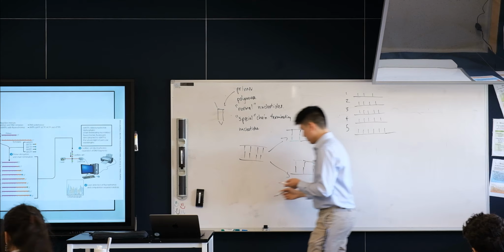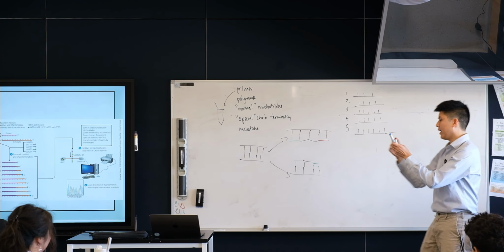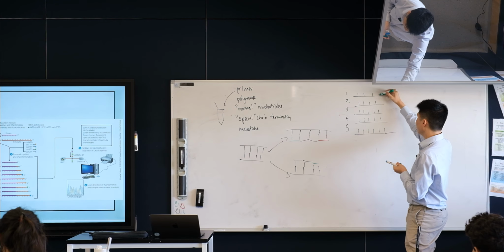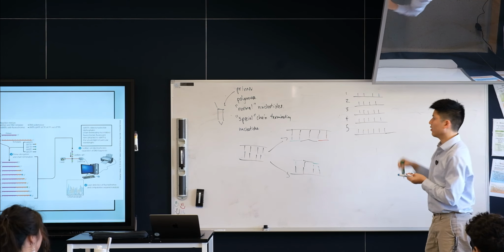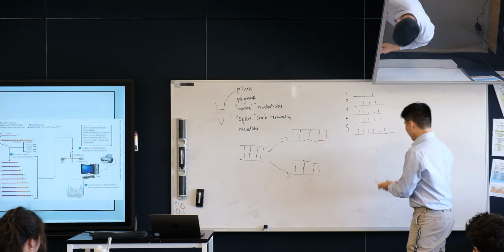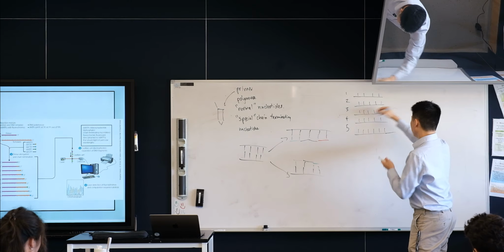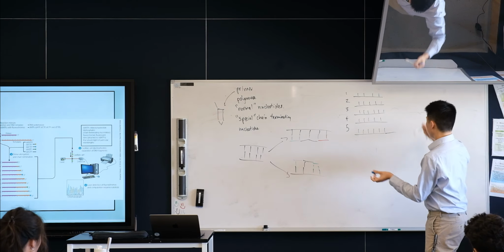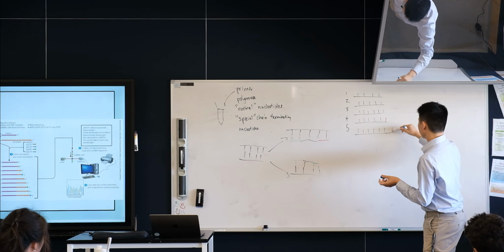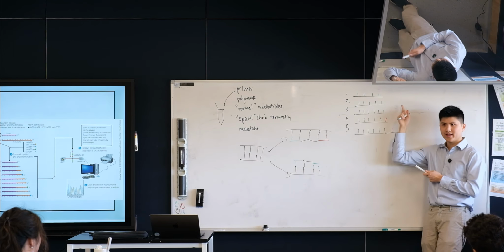All right, cool. So let's just pretend that on this one strand, I hit the chain terminating nucleotide on the 4th base, and on the 2nd strand, I hit it on the 5th base, and then this one on the 6th base, and then this one on the 7th base. Sorry, this one's on the 7th base. And so on and so forth. Can we see how we get this?